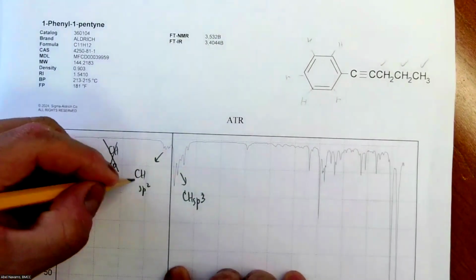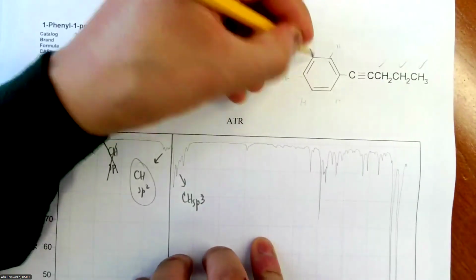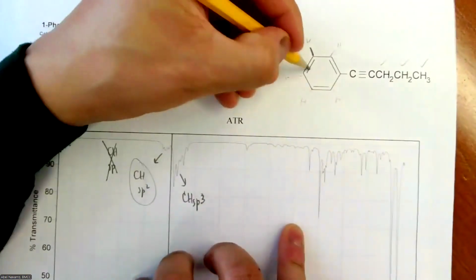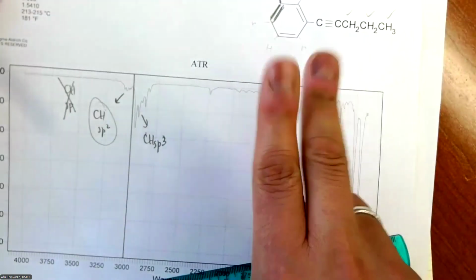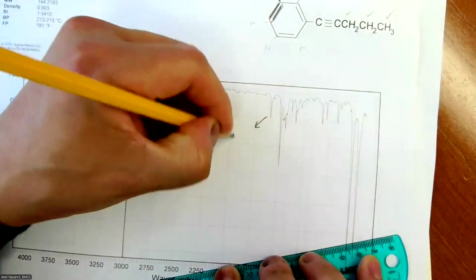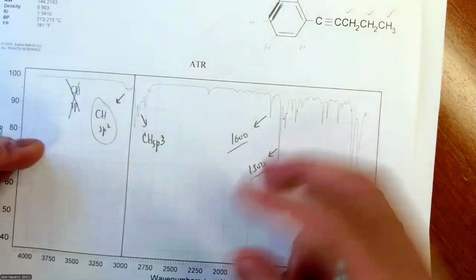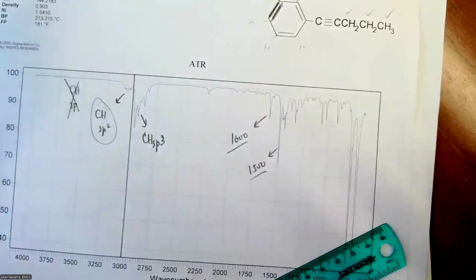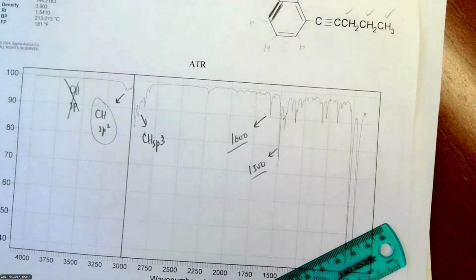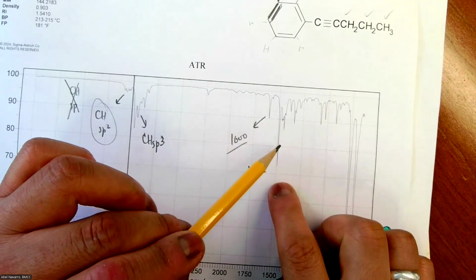Okay. Now, aromatic, right? The same way you had a CH sp2 and you have to see the double bond, right? Because that's what you see in this peak. But where do I see that double bond? Well, that's right here. In the case of aromatics, you will see two peaks, one around 1600 and the other around 1500. Aromatics come in twos. Why is that? Well, because remember, they're influenced by resonance, which causes different resonance structures. And of course, they can be seen. Normally, the one on the left is smaller than the one on the right.